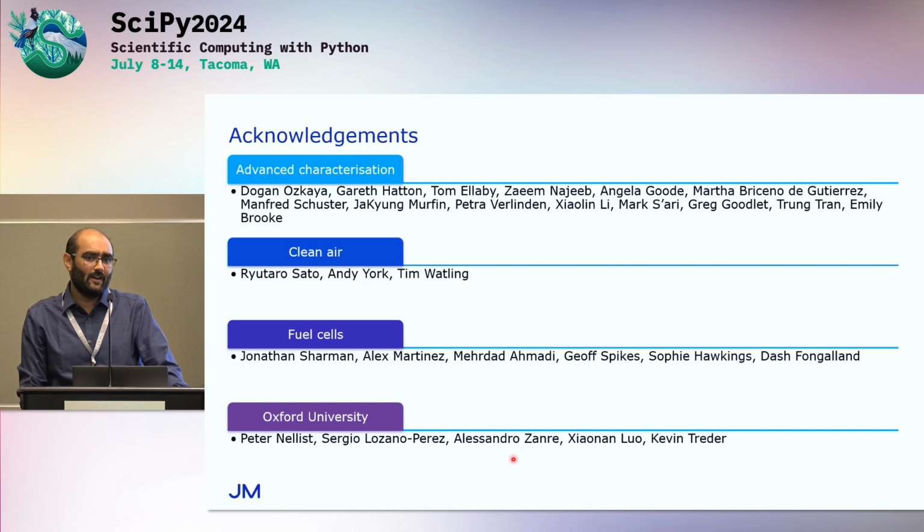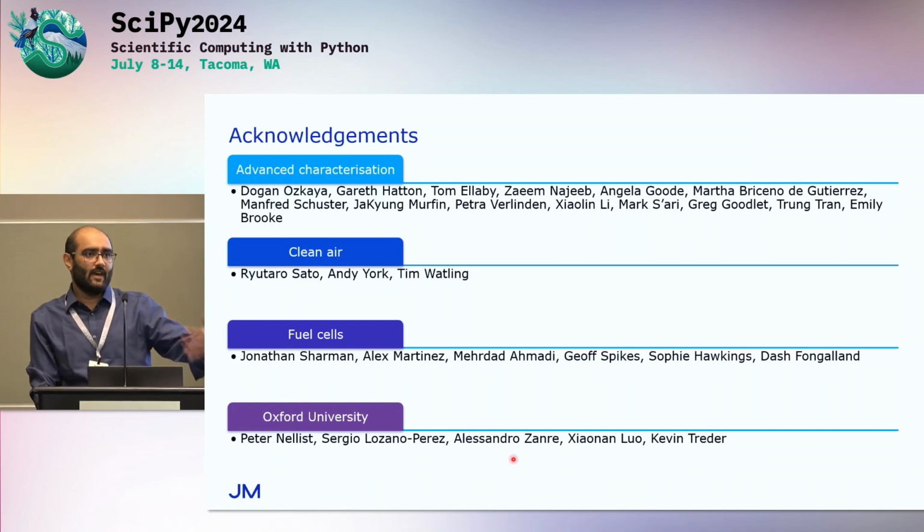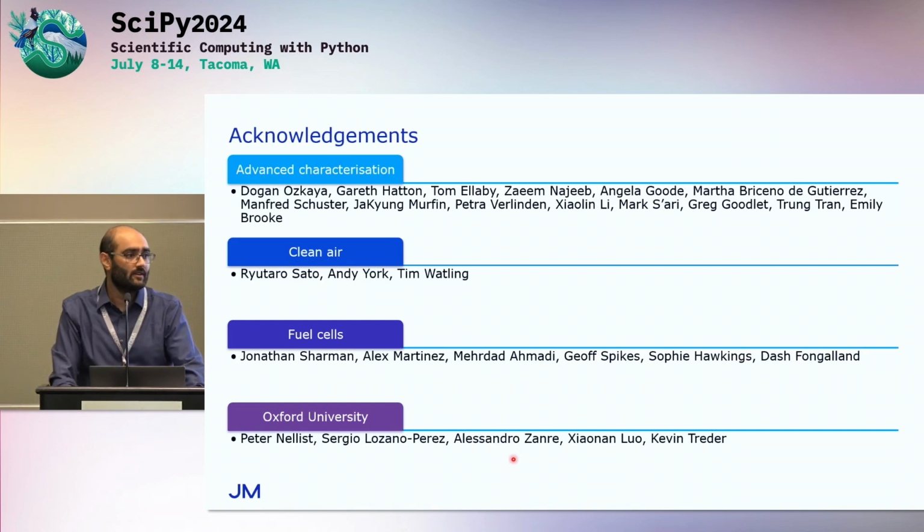And actually, you find this a lot. We speak a lot to Diamond Light Source, which is one of the UK's national labs, and we collaborate with them if we were to release something in that sense for users. That's also one of the problems they face as well. A lot of these national labs have people who come in and gather a lot of data and then they go off, and there's very little aftercare on how it works. What we're trying to provide here is interfaces where it's easier for people to do their analysis very quickly, because that's what they care about. The chemists just care about the results too, because they want to move on to the next experiment.